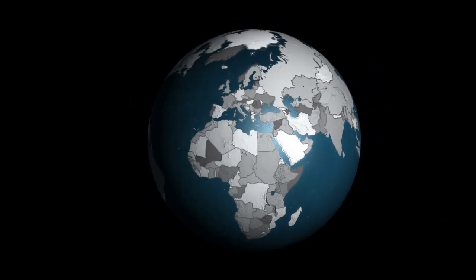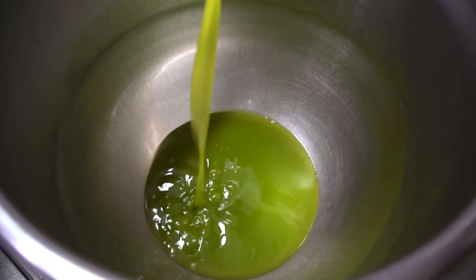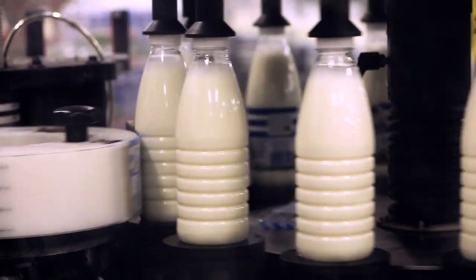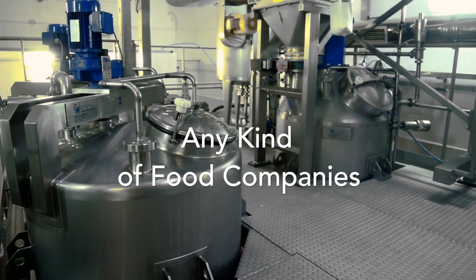Thousands of food industries worldwide are using CDR Food Lab: oil mills, edible oil processing plants, snack manufacturers, milk and dairy companies, egg product producers and any kind of food companies.